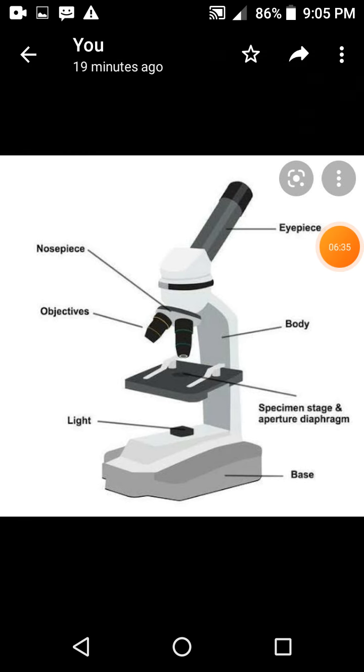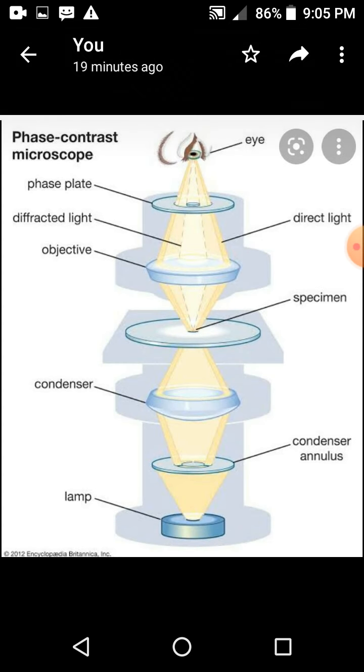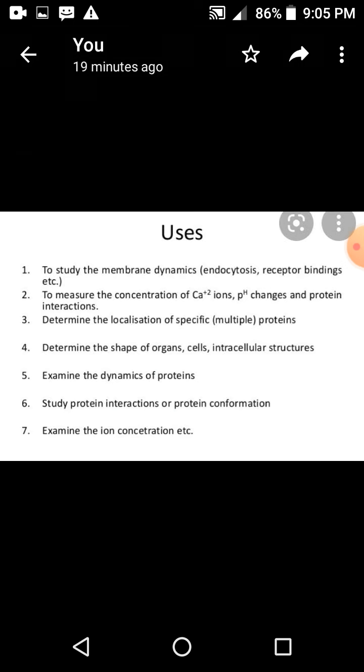Okay, now I will explain the use of the microscope, how it is used. This is the structural diagram. Many things are described here. Okay, now the uses of the light microscope.